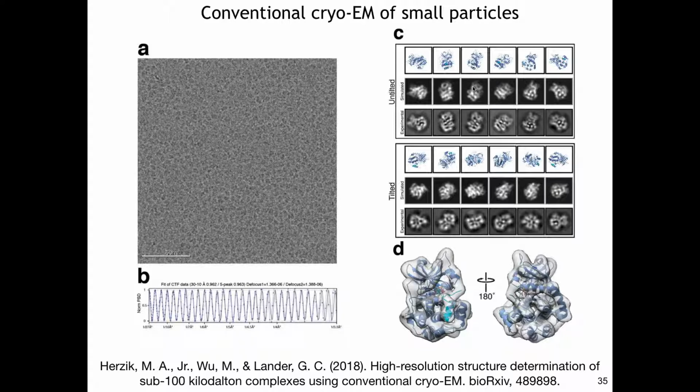So these are all single particles, and they can obtain some two-dimensional class averages and derive a preliminary three-dimensional reconstruction at about 6 to 8 angstrom resolution of this 40 or 50 kilodalton PKA molecule. Now they're still not yet at atomic or near atomic resolution. But this is just to say that the methods are continuously improving. My guess is that with better detectors and better ways of treating the data, one should be able to get pretty close to near atomic resolution relatively soon.